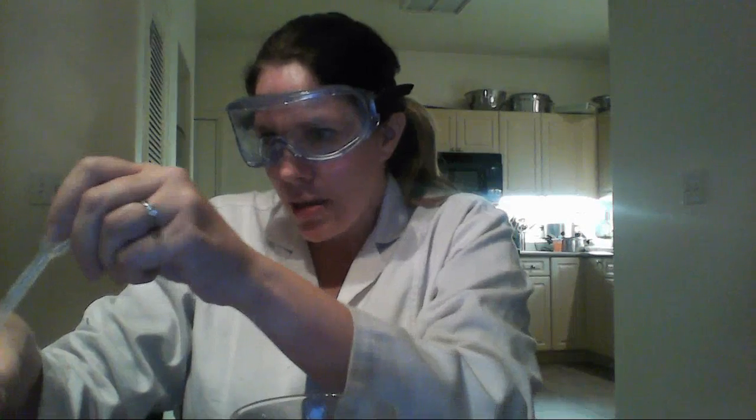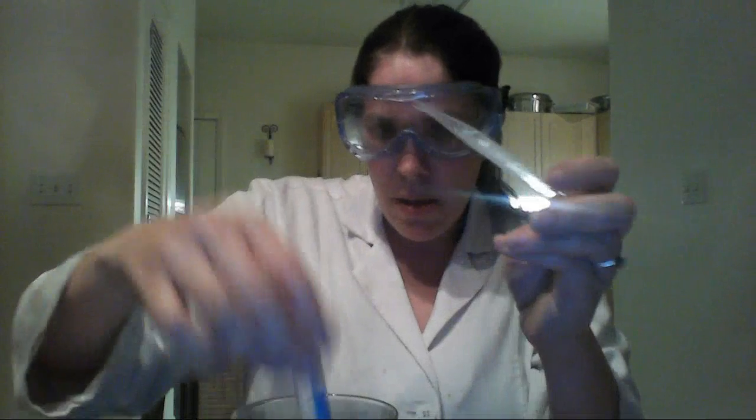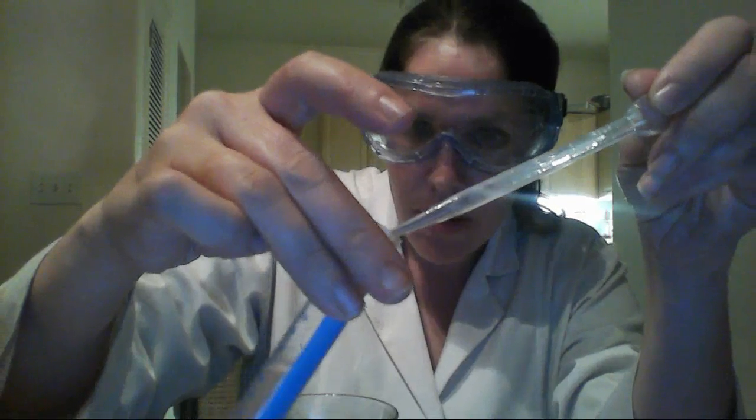I'm going to see if I can do another maybe half pipette full of ethanol. You just kind of want to fill it up at the top. It's not an exact science. Okay, so I'm going to put this back. Okay, and again. And I'm going to go ahead and fill it up pretty close to the top.